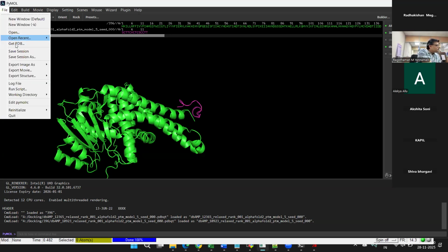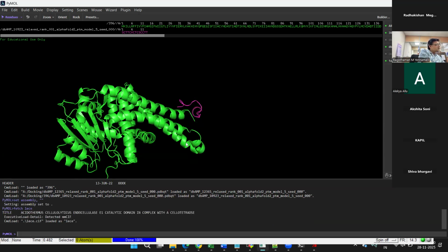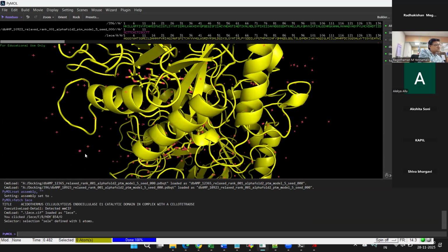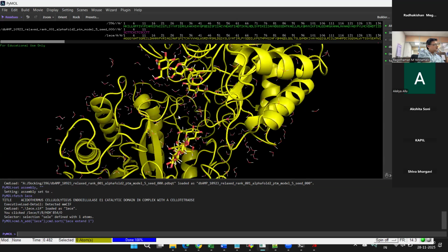So let us say I randomly take a protein from PDB. Okay, so all these red dots are water molecules. How do I know this? Because oxygen is shown in red by default and it's not bound with any hydrogen. Hydrogens are not there in a PDB file by default. So I can confirm it is a water molecule by adding hydrogens. So you can automatically see these are all water molecules, right?